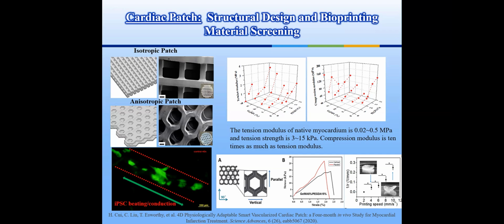And more importantly, we also use iPS cells, human induced pluripotent stem cells. You may have heard about that one because it's really popular. Just several years ago, the inventor, I think a scientist from Japan, won the Nobel Prize for discovering those artificial iPS cells. So we use those cells, differentiated into cardiomyocytes, sitting on our construct. It's also pretty well compatible.